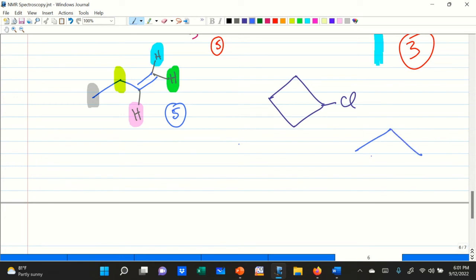In a ring structure, you have to draw out all the hydrogens that are present, knowing that a ring structure is also a rigid structure. A cyclopropane, cyclobutane, or cyclopentane structure has an approximate molecular plane. Therefore, there is an up-down situation, which is what we have seen with cis and trans isomers in cyclopentane or cyclobutane.